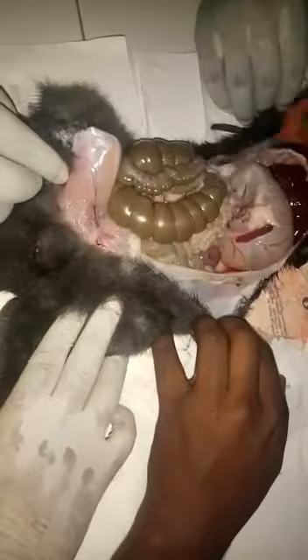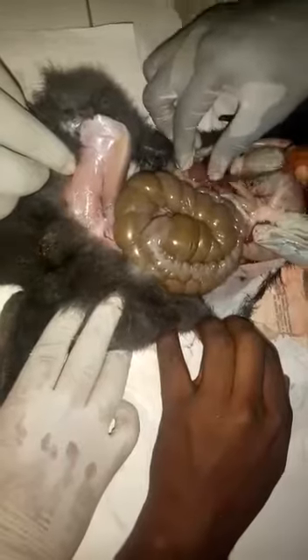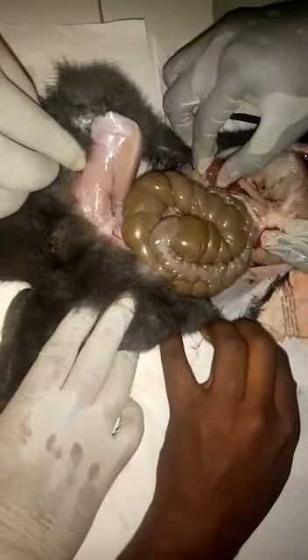Then let's look at the other side. This is the what? The right kidney. This is the right kidney, isn't it? Those are the blood vessels. Good.